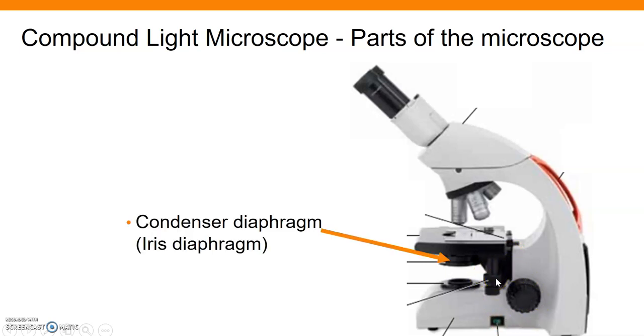Let's start with light. I said your light comes through here, so this is the lamp. This is controlled by the rheostat, which was on the left side. The lamp light comes through. It can also be controlled by this little mechanism here. It's a little sliding knob. If you turn it right and left, it will control how much light is actually passing through this area here where the slide would be. This is called the condenser diaphragm. It's also sometimes called the iris diaphragm because it acts kind of like the iris of our eye to control how much light is going to come up through the slide. The lamp can be controlled by the rheostat, and then the condenser diaphragm will control how much of that light actually gets to pass through the slide.